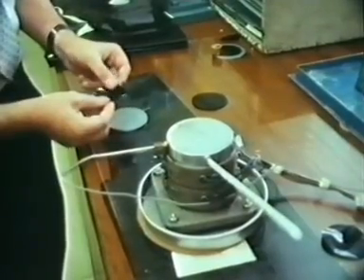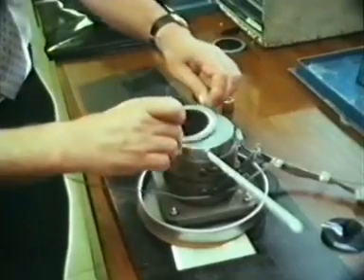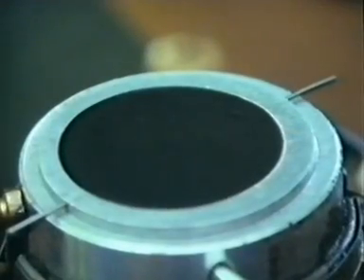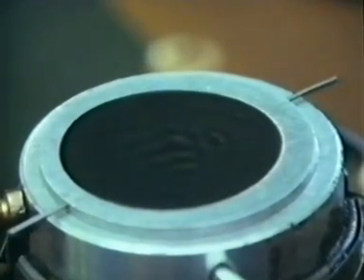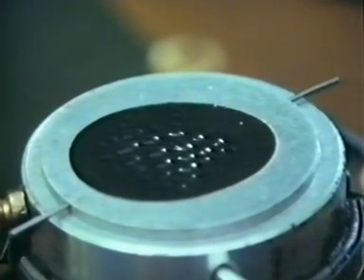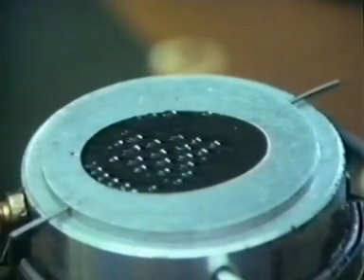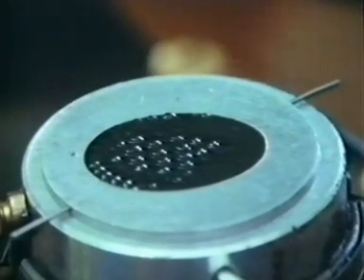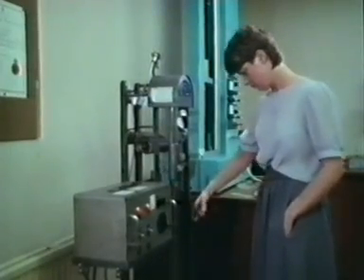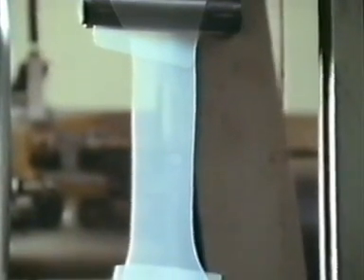A test is being carried out which shows how polyethylene sheet, for example, has different properties in different directions because of the way in which the carbon chains are pulled into certain patterns when the sheet is produced. If a disc of the sheet is heated, it shrinks more in one direction than the other. This means that it behaves differently when it's pulled, say, in two different directions at right angles. Here, in one direction, it forms a narrow neck which stretches and stretches and stretches as the tension is increased.